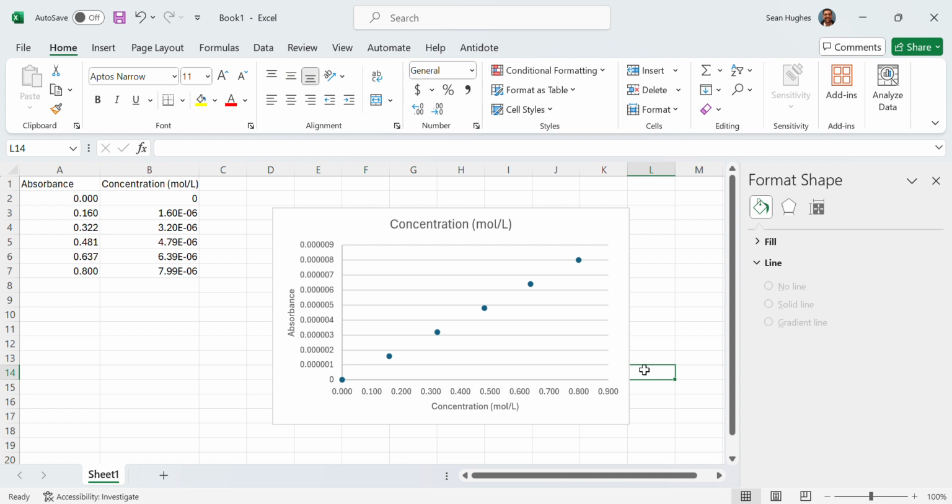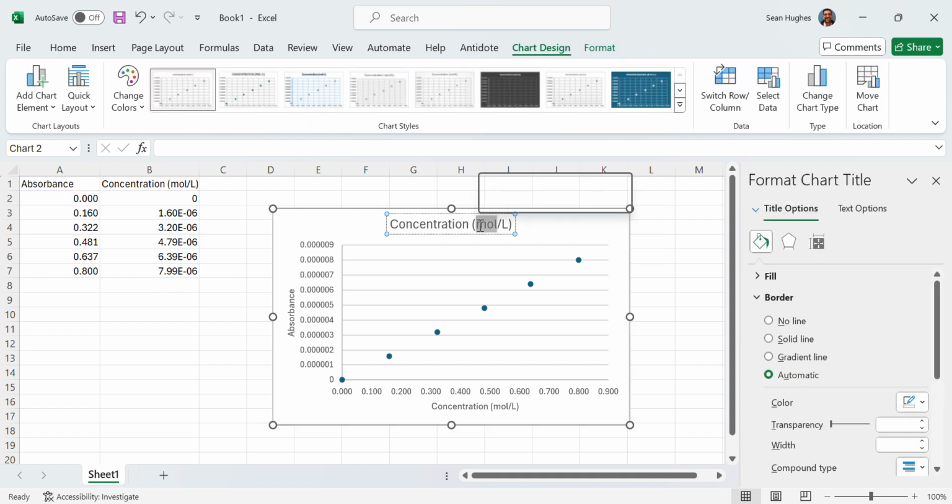And typically in a graph, we open up rounded parentheses and we put in our value, our units, in rounded parentheses. And then we're going to add a title, and a title in science could be Y versus X, sure, but I could read the Y and the X title. And so what I want to challenge you all to do is try to think of a title that's descriptive, that tells, you're trying to give the reader a sense of what is it that this data is good for? What's the story that it wants to convey? And usually it's related to one of the objectives that you're doing in this lab exercise, or something that will help lead you to figuring out the objective.